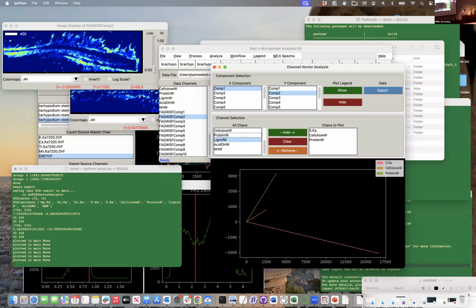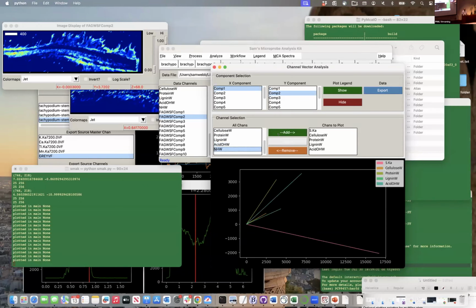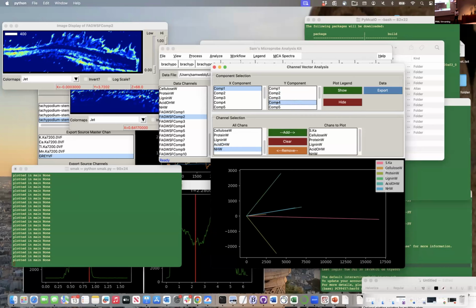Now we did notice, when we did this yesterday, in some cases, and then you can go through the different components and see how they change. We had it here that the X-ray data was on one axis down here, and I had two different axes of infrared data. We didn't get the awesome result like I had with the calcium carbonates and the infrared, where the infrared stretch of carbonate totally matched the calcium.